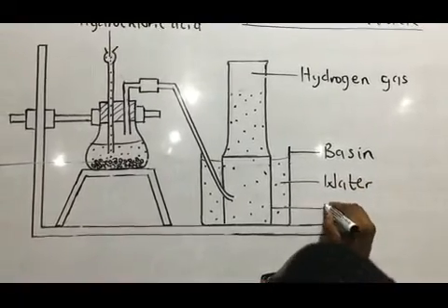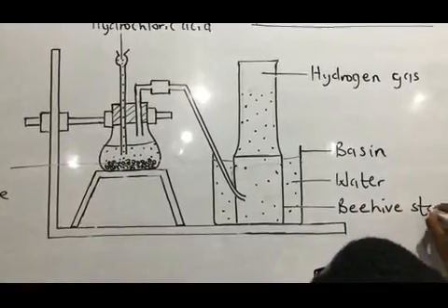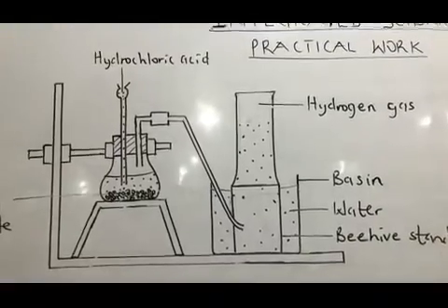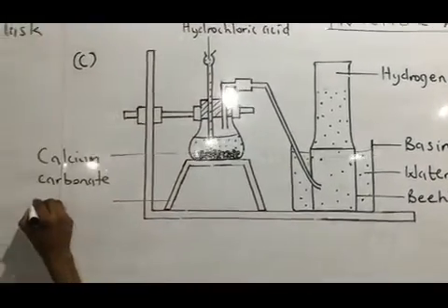And then this one is we have stand. I'm only labeling the parts that were not here. And this is the tripod stand.